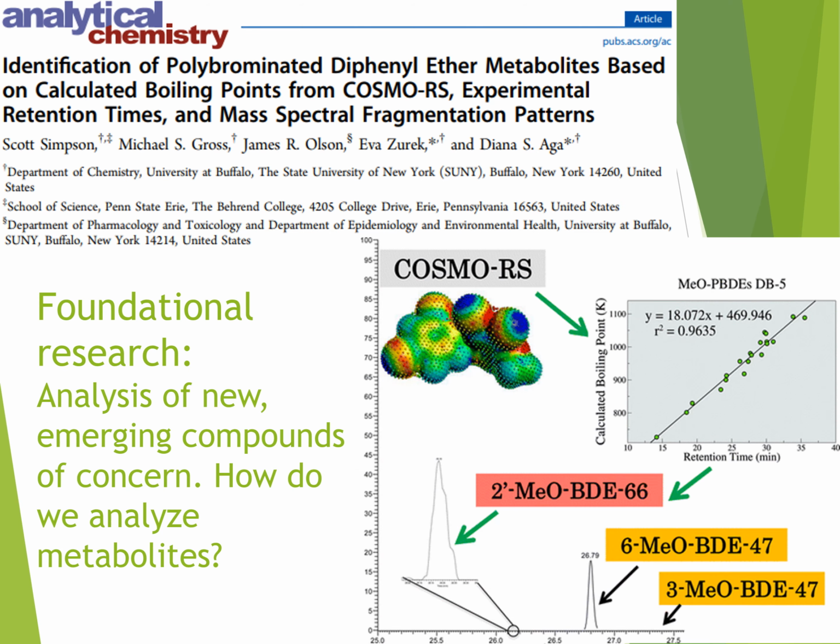My advisor, Dr. Scott Simpson, has published in this area before, and much of the procedural knowledge for this paper was gained from this study titled Identification of Polybrominated Diphenyl Ether Metabolites based on calculated boiling points from COSMO-RS, experimental retention times, and mass spectral fragmentation patterns. This is foundational research for this present study that analyzes new emerging compounds of concern. It shows ways by which we can analyze potentially dangerous metabolites through ab initio analysis.